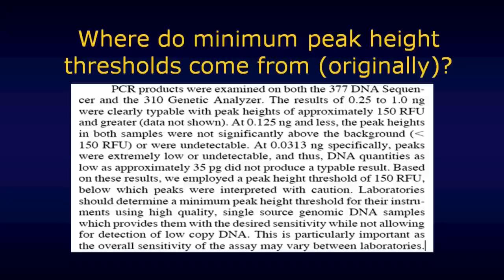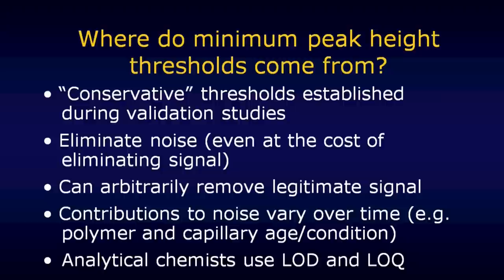It didn't have anything at all to do with distinguishing between signal and noise, and yet, to a large extent, crime laboratories that do DNA profiling have been using it for that other purpose, as a quick way of eliminating from consideration the possibility they're confusing signal with noise. In such circumstances, laboratories have argued that what they're doing is conservative, right? They're disregarding things that may not be reliable. We all would support their using their most reliable information, right?